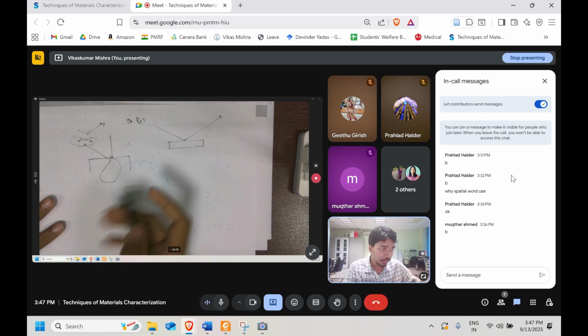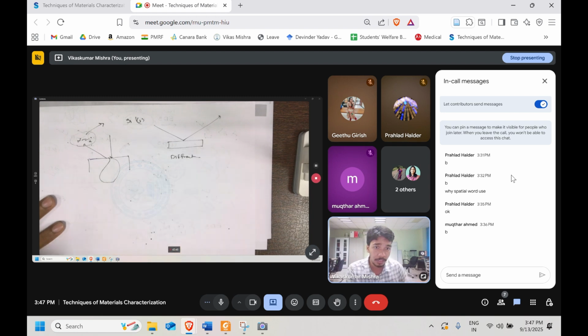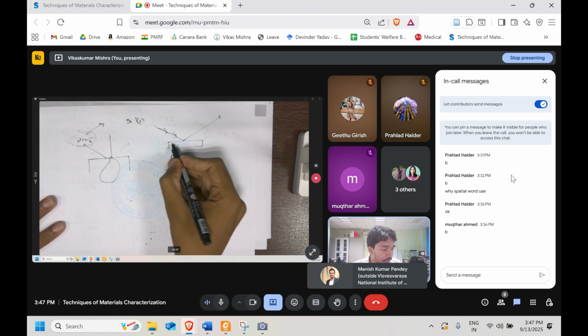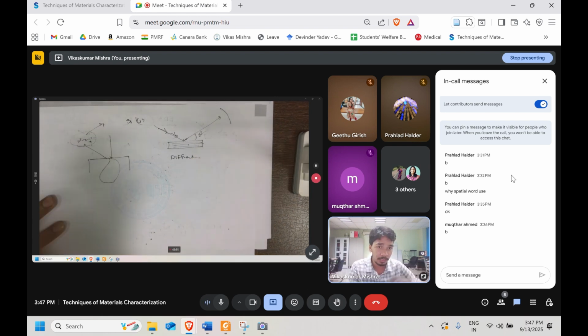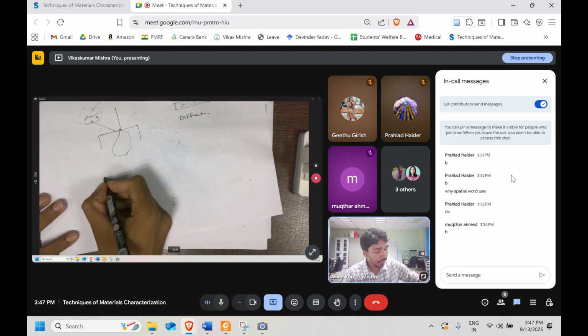Since the phenomenon happening here is diffraction, the incoming X-ray beam generated by the specimen interacts with the single crystal, and with diffraction it will give the theta. From there you can precisely say that this is the element which is produced, and these are their weight fraction, volume fraction or mole fractions.